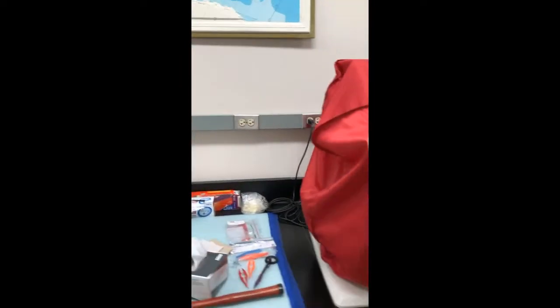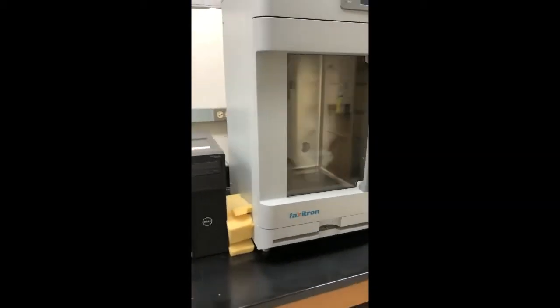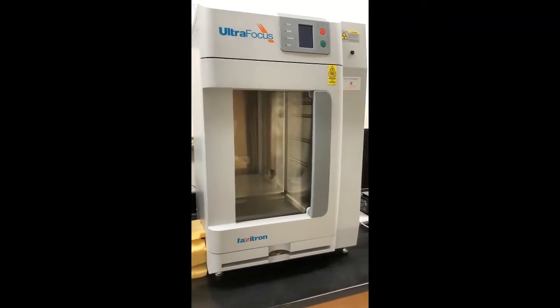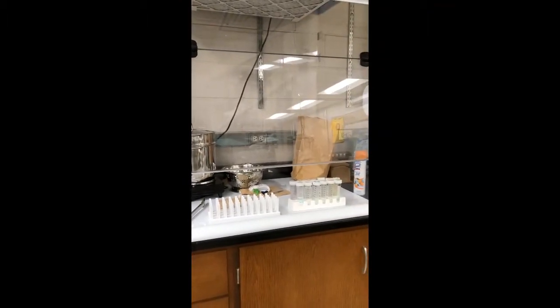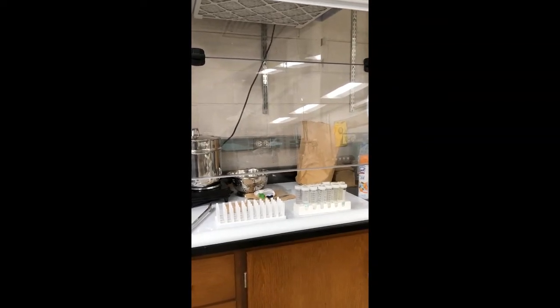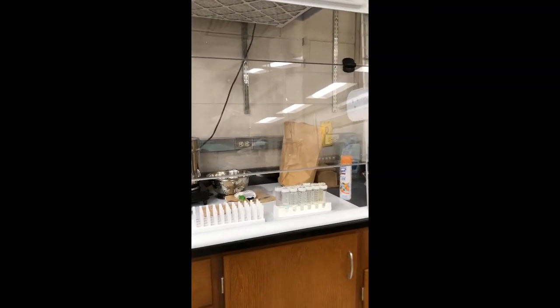We have a very nice Leica microscope in order to do work on cases, and also a Faxitron box x-ray machine, again for casework and trauma analysis and experimentation. In the past, we have also conducted quite a lot of work on trace isotope analysis in surface and bulk dental enamel in order to help identify the origin of individuals who are deceased and have remained unidentified.